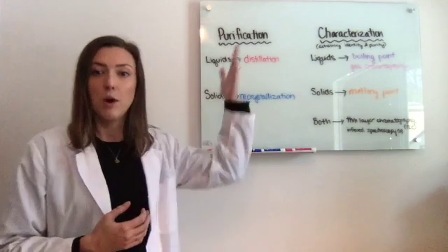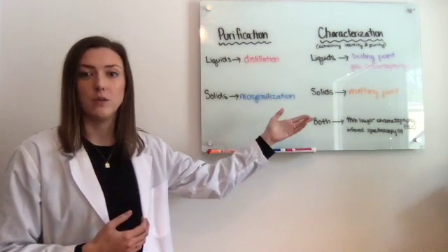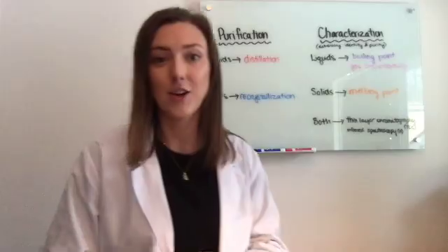recrystallized. We have boiling point and gas chromatography that are used for liquids, melting point for solids, and then we use TLC plates or thin layer chromatography and infrared spectroscopy or IR for both solids and liquids. So let's take a look.